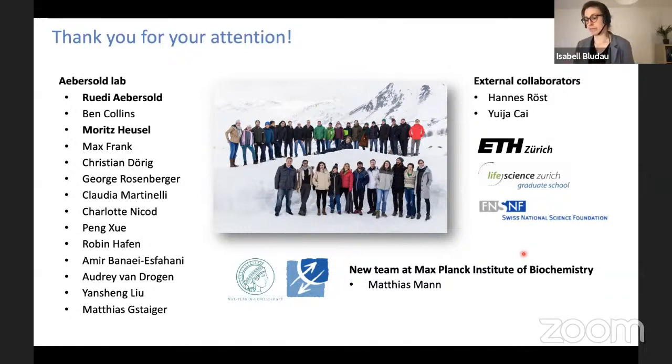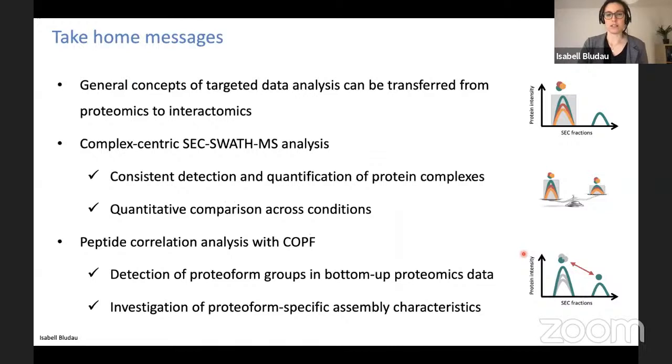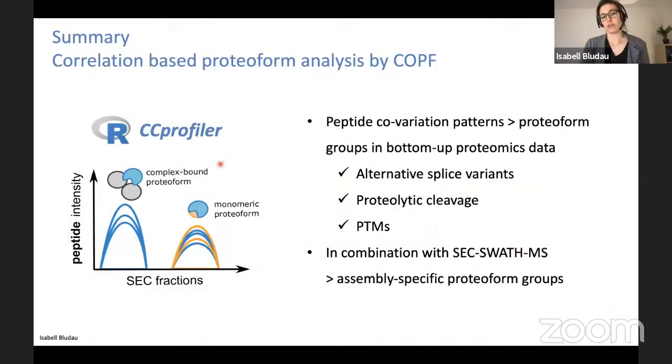This is basically what the entire strategy of this proteoform-specific assembly boils down to: we have the opportunity to see that proteins elute multiple times in the SEC dimension. We observed this for around 30% of the proteins, which have multiple elution peaks along the SEC dimension.